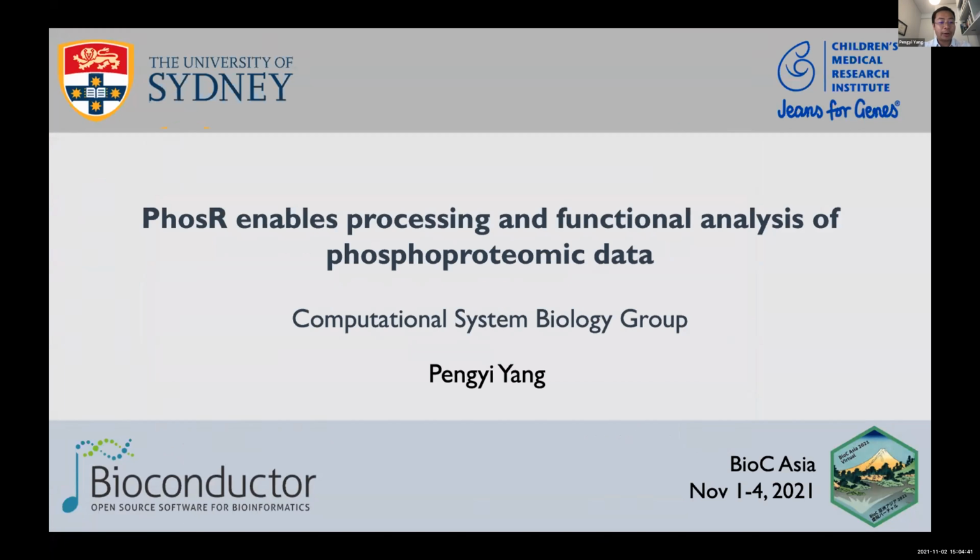Okay, thank you. Thanks for the opportunity to present today. I'm going to talk about PhosR, a package we developed for processing and functional analysis of phosphoproteomic data sets.